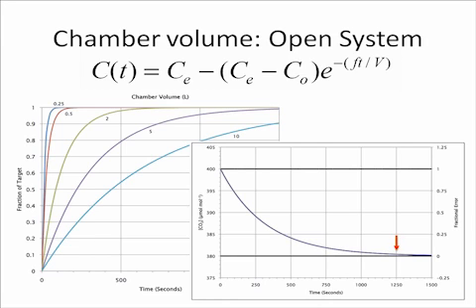If we use the curve in this first figure to model the chamber CO2 concentration, we see that it takes about 1,500 seconds for the chamber to go from initiating the change to the target concentration. If we wanted to calculate photosynthetic rates or a flux using this example, we'd have to wait about 21 minutes after placing the sample in the chamber before the error in the measurement due to this stabilization was less than 1%.